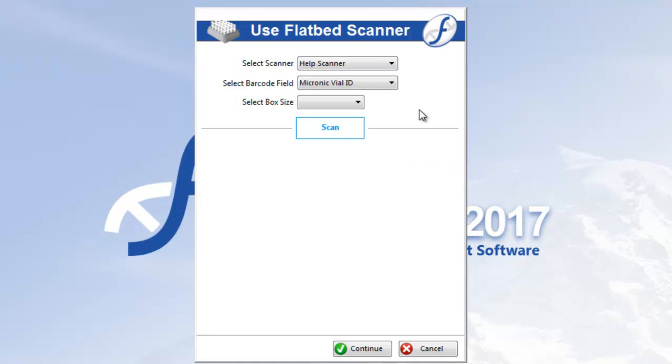So first you'll select your scanner, and if only one scanner is configured in your database, as is the case for me, then it will automatically be selected. The barcode field defaults to the selection made during configuration, but you can change it if you like here.